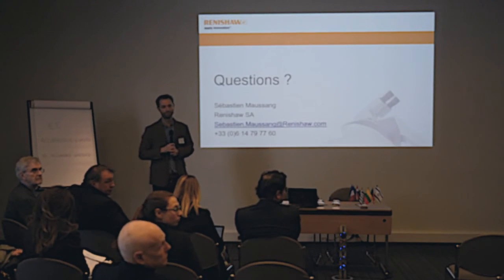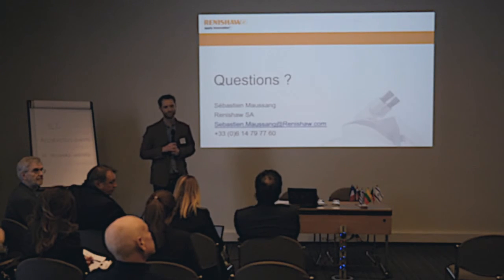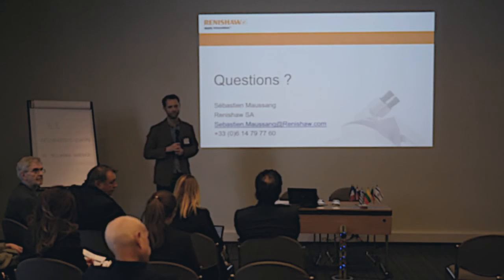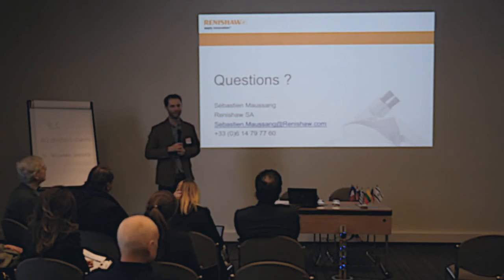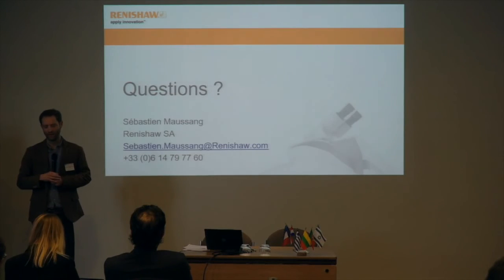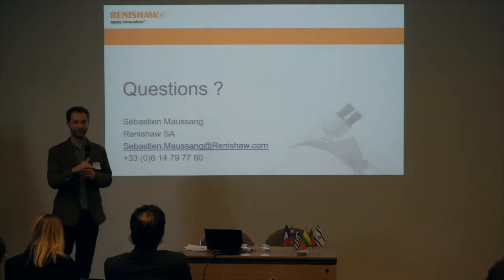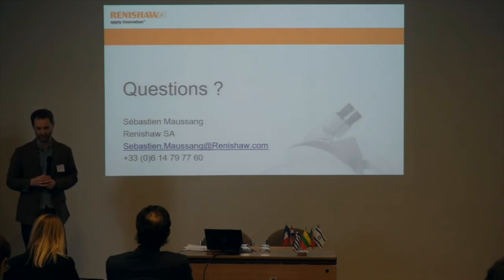We put that specification, the Raman specification for within the tape, based on experience from drug laboratories that nowadays use portable instruments, which can sense the contents through the packaging. So we concluded it should be possible to do that as well. Through the packaging, that's the basis of that specification. But if that's not possible, then we should change it, or you should add to it. Maybe the technology of tape I've been using has evolved. I'm sure it has. I've been using standard SEM ones, but those tend to burn.